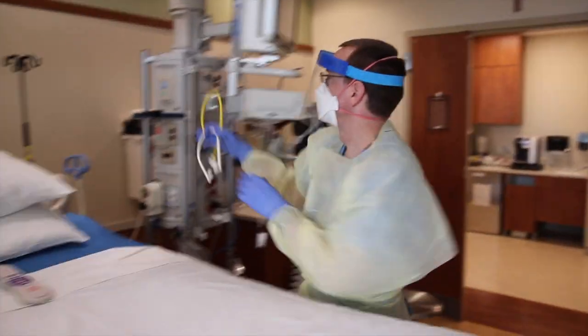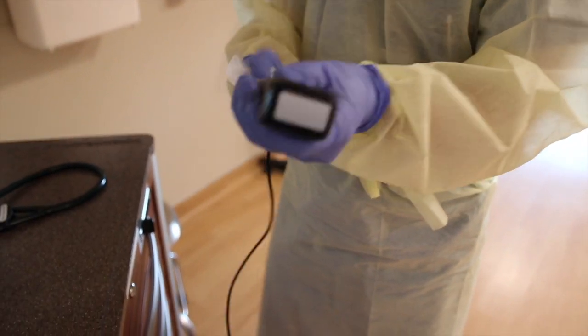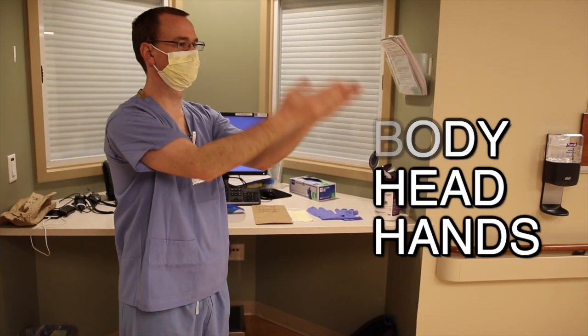After you are done seeing the patient, you will need to remove your PPE properly. If you have used a disposable stethoscope, please remove it and leave it in the patient's room at this time. If you have used your own equipment, wipe it down thoroughly with the sanitizing wipes and place it at least 6 feet away from the patient in a clean area. Similar to before, the order of taking off your PPE is hands, body, head, hands.